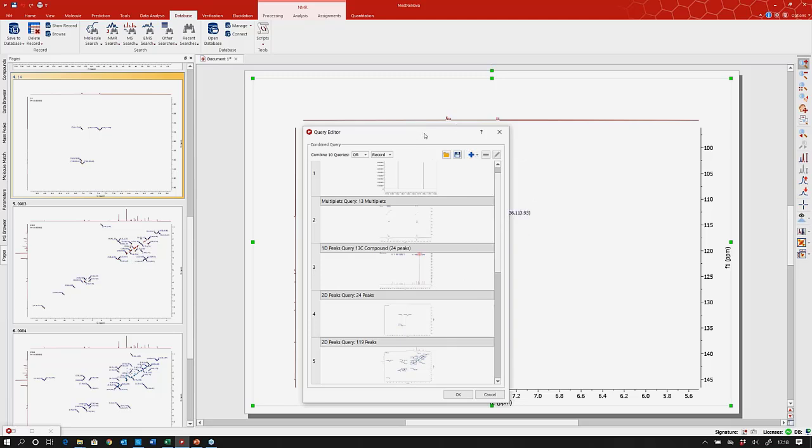Okay, so you have the ability to build very complex queries. If you have a very large database, imagine with hundreds of thousands of records or millions of records, then obviously you want to be using more restrictions so that you get to a meaningful set of results. Okay, we're not going to run an advanced query. I just wanted to highlight that it is there. So we're going to close this window now.